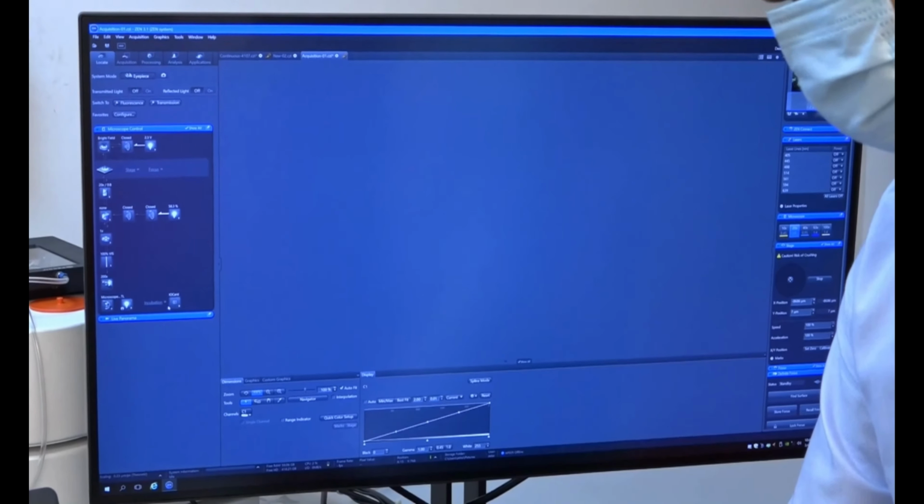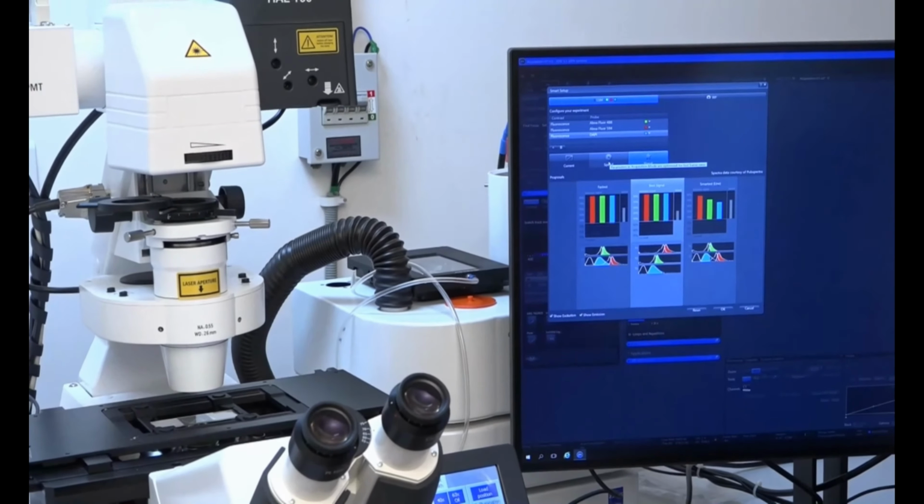So once I select, I have a window here, I can select as many dyes as possible. So I can click here, and from the database there is a list of dyes available in the drop down menu. As you can see here, in the drop down menu mostly commercially available dyes have been exhaustively listed, and based on my dye I can select any dye and add it here. So after I add, the system automatically will give you 3 options. You want speed or you want signal.